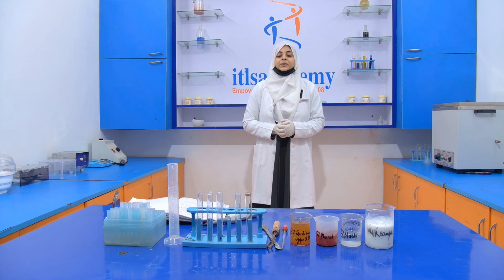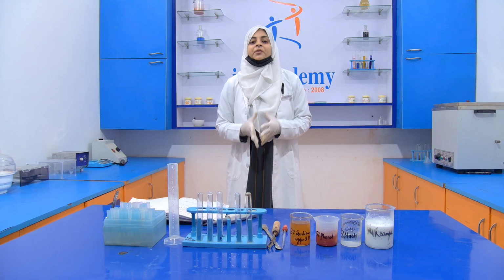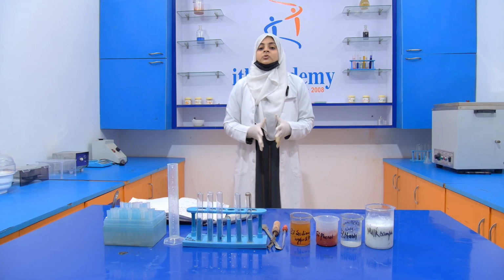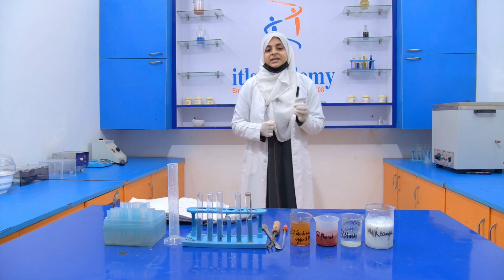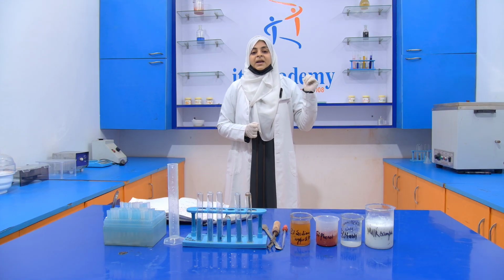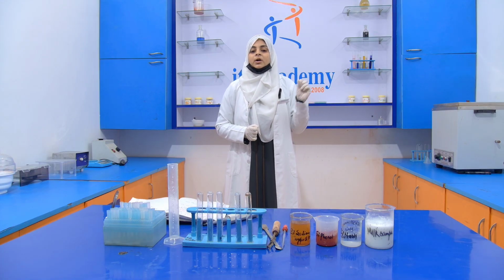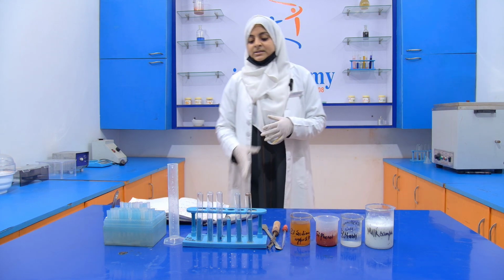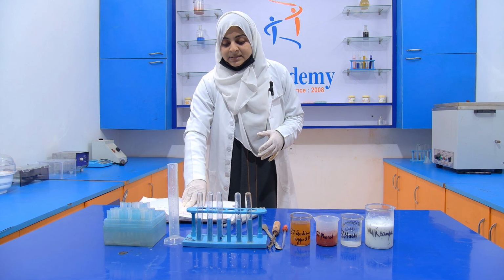Now what is the reason behind the addition of ammonium salt into a milk product? The answer is very simple. The reason behind adding ammonium salt to milk is only to increase its density.